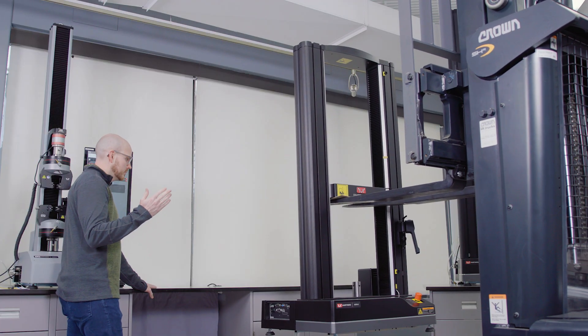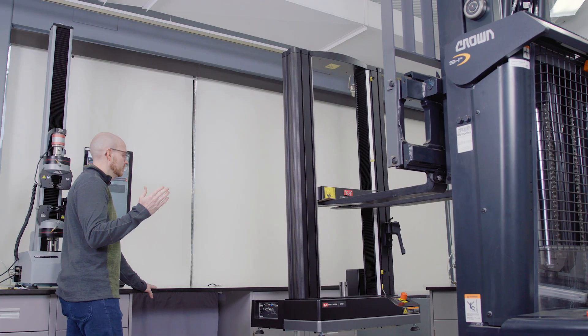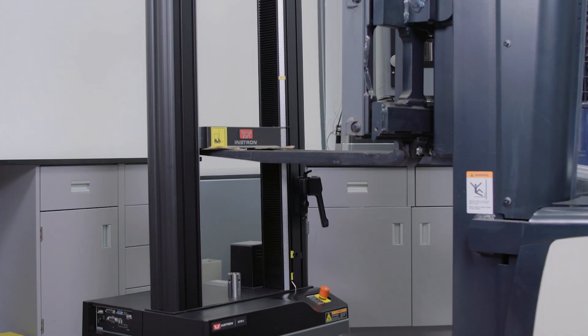When moving your system via forklift, there are two methods to choose from: the shipping skid method and the crosshead method.